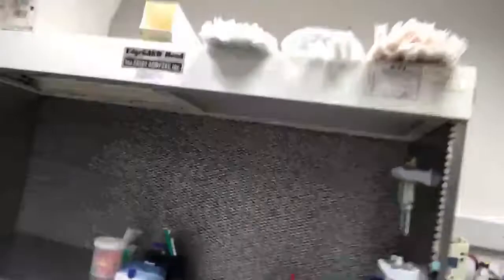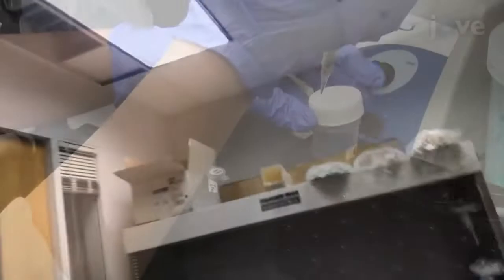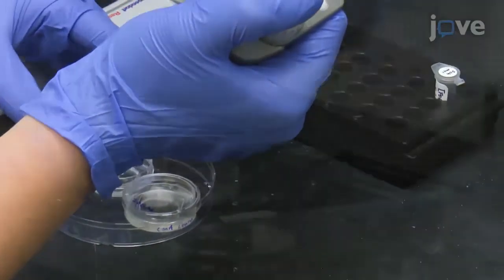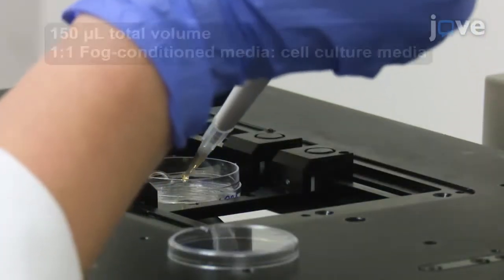I also thought I'd take this opportunity to give you a quick tour of the lab. So over here we have the tissue culture hood — we'll take a step back — this is where we culture our cells.